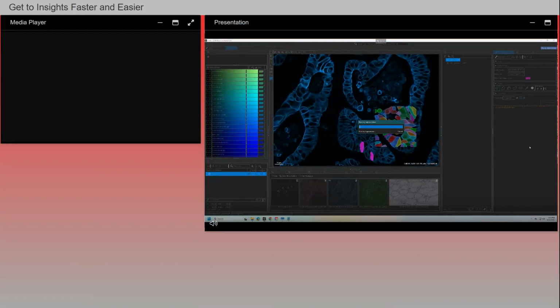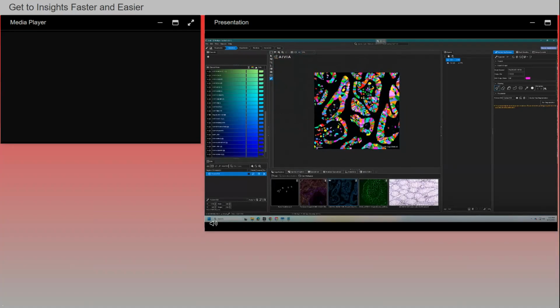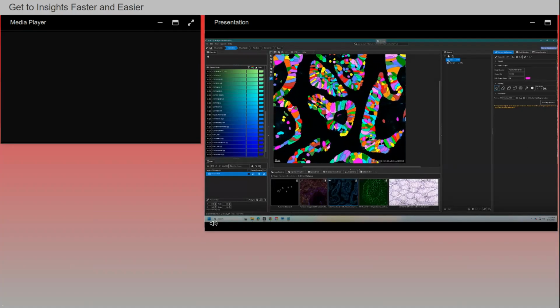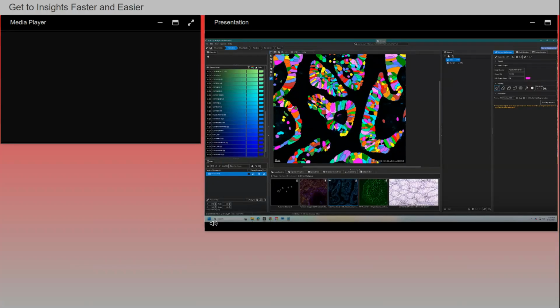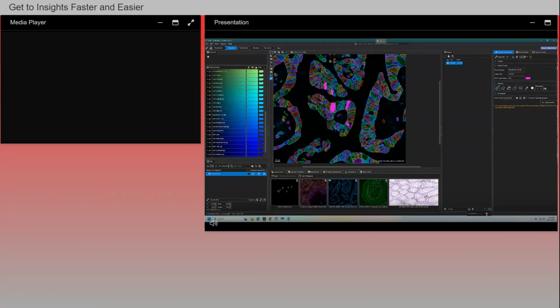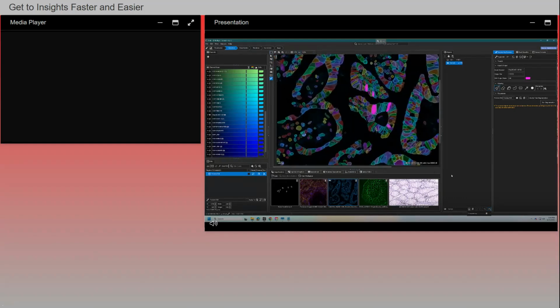So I'm going to run segmentation here for the entire image, and this is the output, and I think it looks actually pretty good here. I'm actually quite happy with it, and there's no training involved here. It's simply parameter estimation, and I'm selecting the objects that I've just detected and adjusting the transparency so you could see the output, and to me it looks actually really good here.